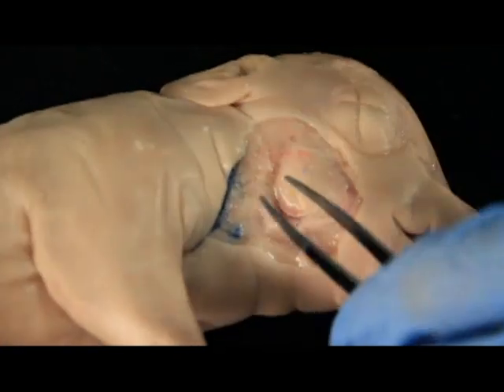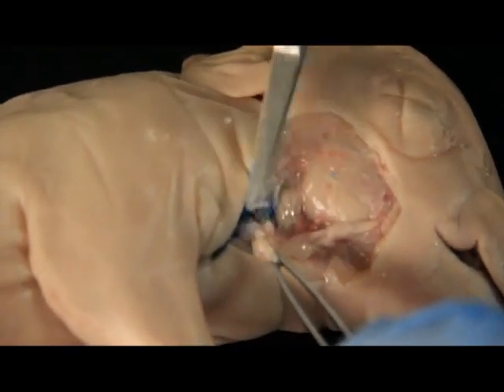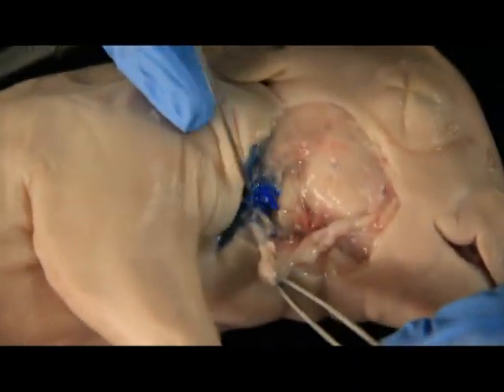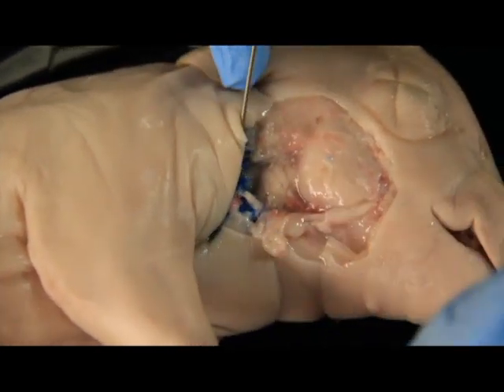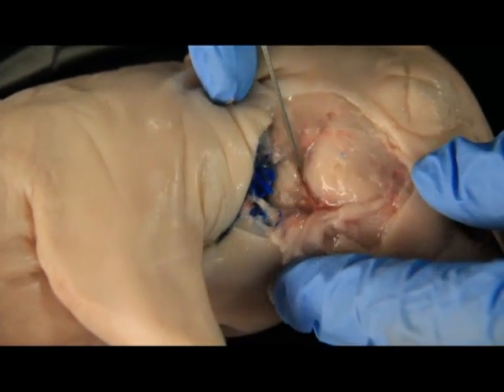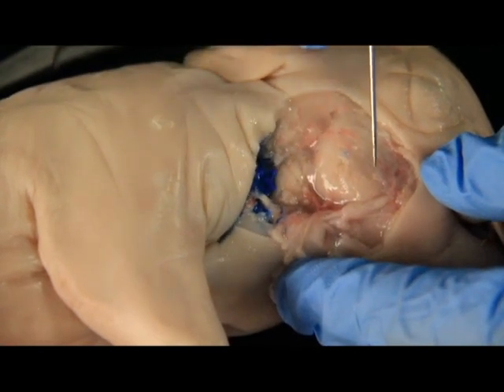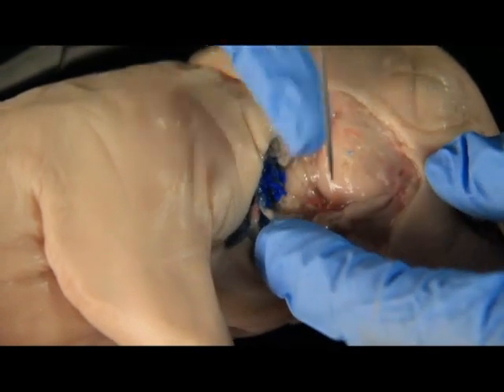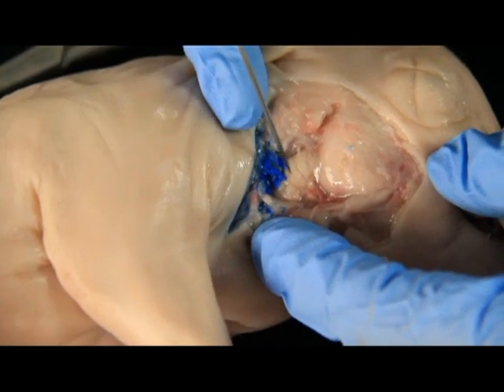So if we keep going a little bit, go a little bit farther down the parotid, what you should expose, and your book even shows your tool pulling all this away and uncovering the gland underneath, this right here, this gland is your mandibular gland. So again, to the right of the masseter muscle, underneath all of this parotid, this fatty neck tissue, it's going to be this little bean-looking thing. And this little bean-looking guy right here, that's your mandibular gland.